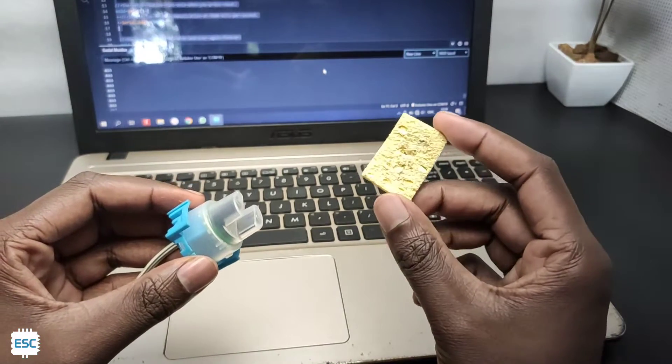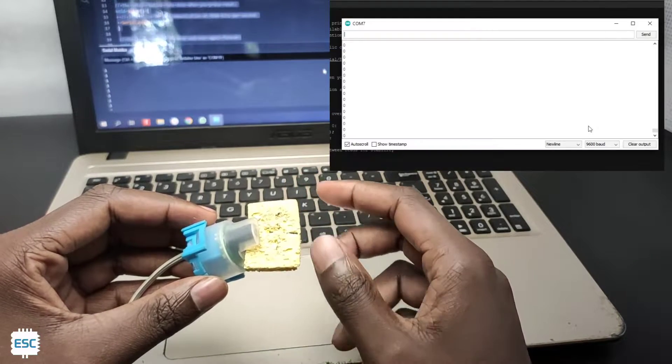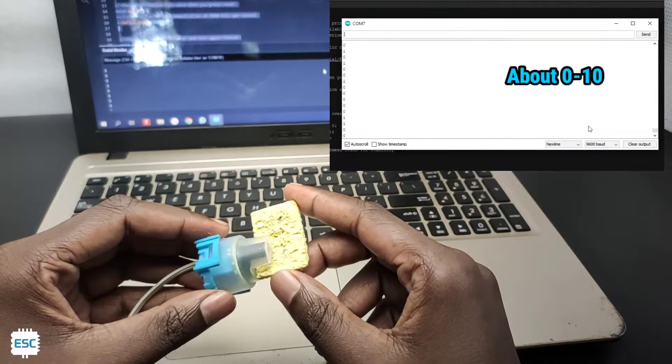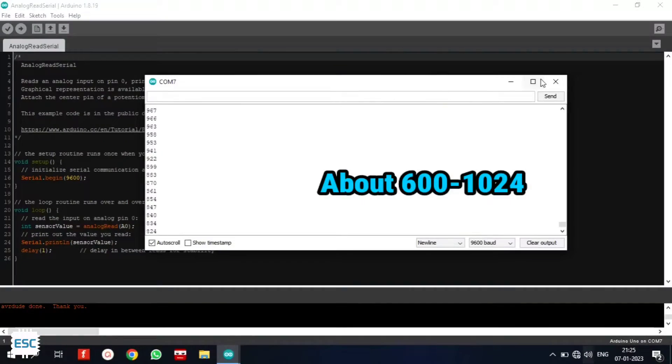Now apply some blocking material in between the sensor, just like in the video. And note that value. That value is the maximum turbidity value. Also note the dead value.